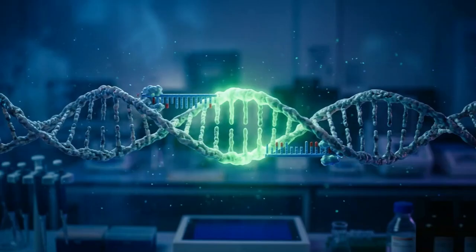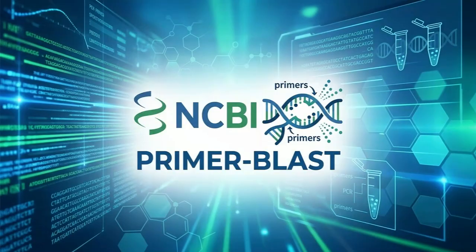So, how do we design primers correctly? Today we will use a tool called Primer-BLAST. Primer-BLAST is a web-based tool developed by NCBI. It allows you to input a DNA sequence and automatically designs optimized PCR primers. It also checks specificity across the genome to ensure your primers bind only to your target region.